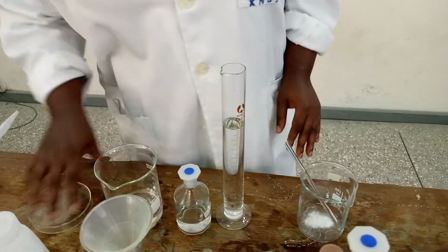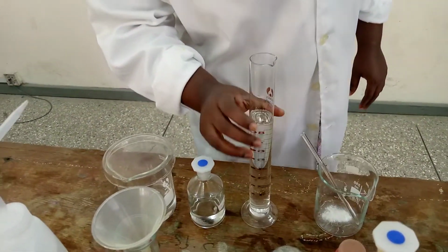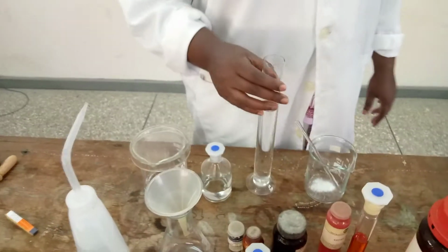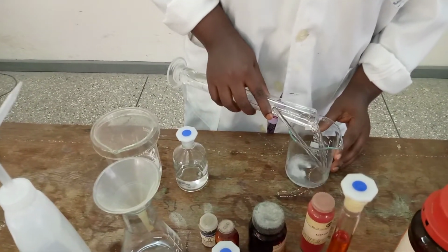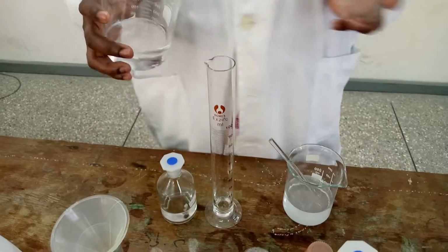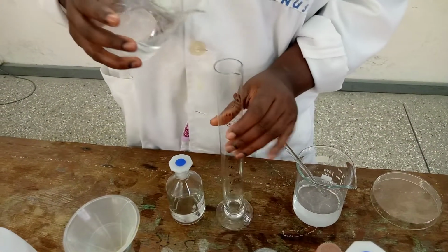Cover it quickly and check if it's on the meniscus. You let the calibration face you, then you bend to check. Yes, it's on 100 ml. So I'll quickly transfer it into my dye. It's 150, so I need 50 more ml of the ethanol to add to my remaining 100 ml.